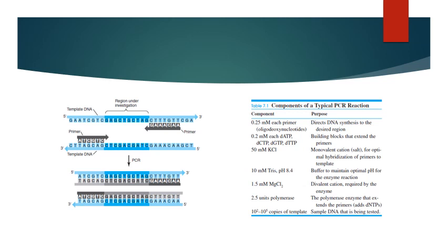And if you're testing for a limited number of amplification targets, all of these things have to be physically and chemically controlled, because the DNA can get everywhere. It'll cling on you, so you never go backwards. You never walk backwards through the door to the PCR areas. Equipment, including you, the laboratory gown, your gloves, all that stuff, all those reagents have to be dedicated to either the pre or the post PCR areas. Items can flow from the pre to the post, but they can never go in the opposite direction without decontaminating first.